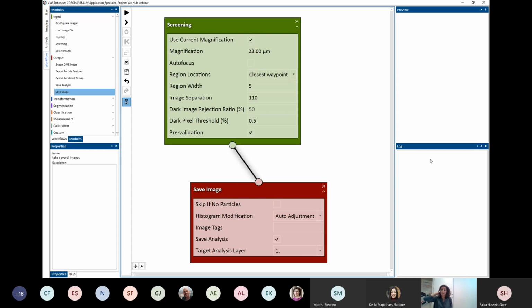There is no analysis done right now, but if you would run an analysis, that would actually be slotted right here in the middle between the image coming in and the output. You would potentially want to save that, but that will be clearer when I show you your workflow.